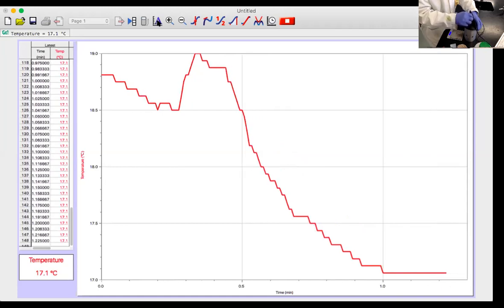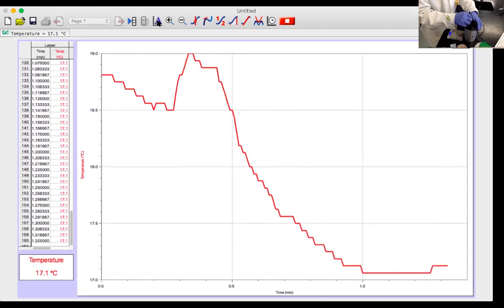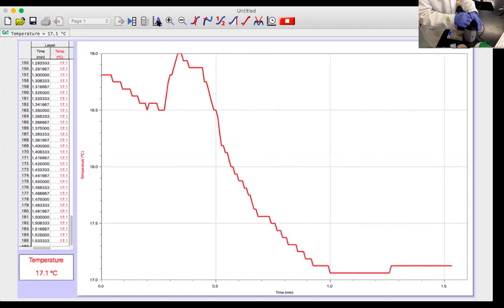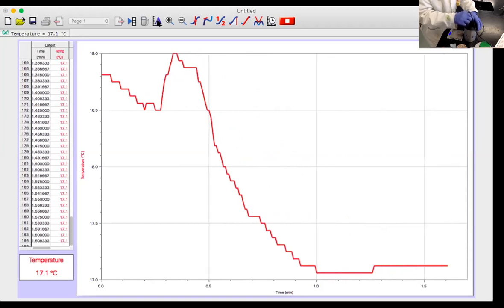We're getting a flat line there at the bottom. Just came up a tick, so we might be done. It might have been the low point. Yeah, that might be it. Give it another second. All right, that's good. We have our data.